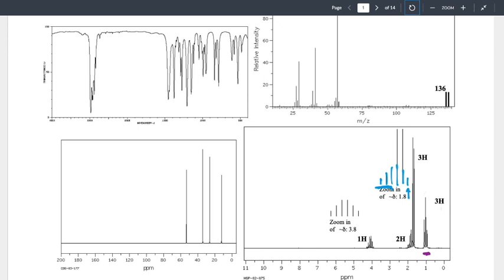Right? So we've got a drawing up here. So what we want to do is take a look at 3 neighbors, or 3 bonds. So we'll start with this first one. I want to count within 3 bonds. So there's 1 bond. There's a second bond. Is that a hydrogen? Yes. Is that a neighbor? Why not? It's all the same carbon. That's what I say. Which is fair.